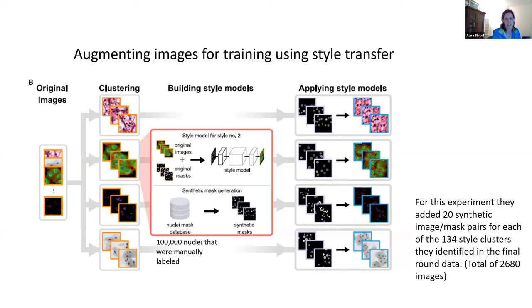So it helps to define cells, or it helps to segment the nuclei from its surrounding. This is the task, to segment the nucleus, right? And you need to refine the model to detect what is the nucleus. And to detect it, you need to separate it from its surrounding. So its surrounding is the style. Okay, thanks.